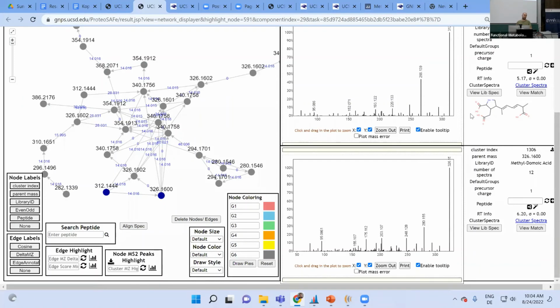And in our case, it was successful, and we could show by total synthesis downstream that this was actually correct. I think this is really powerful, because I don't need to purify something right away to get an NMR structure, which, hands down, at the end might be one of the options I have to ultimately prove it, but I get suspect structures or putative structures fairly quickly. So I think that is very useful.